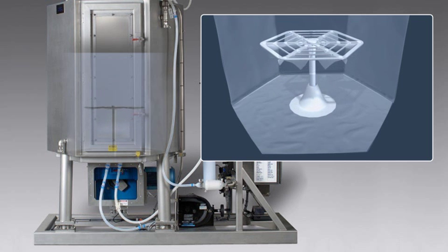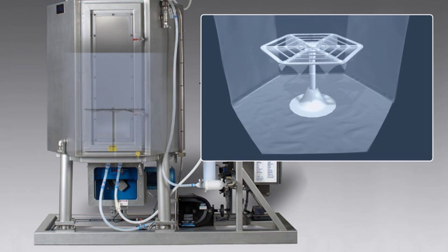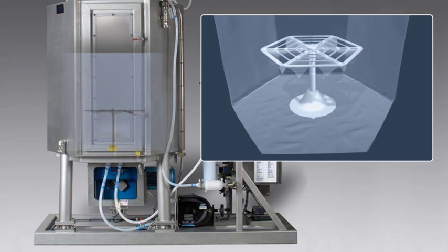The action of the disc, flaps, and slots ensures thorough mixing throughout the bag, hydrating powders in 5 minutes or less.